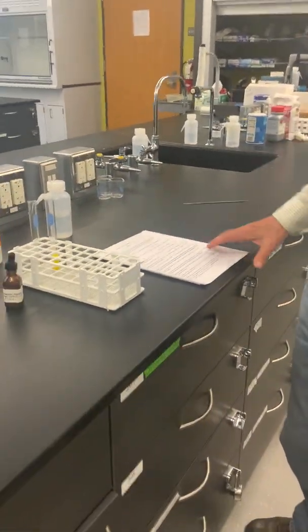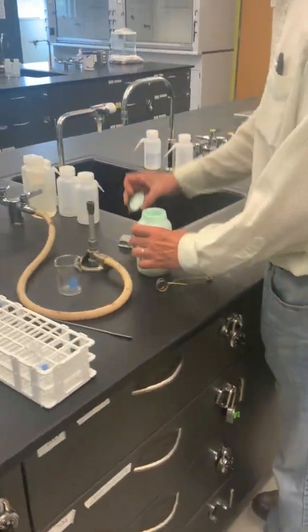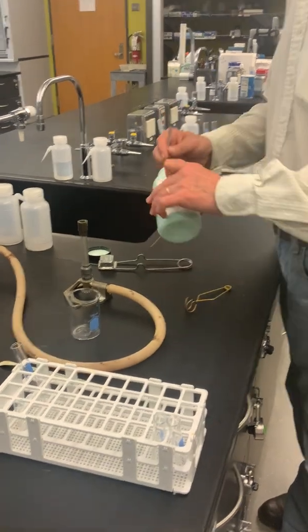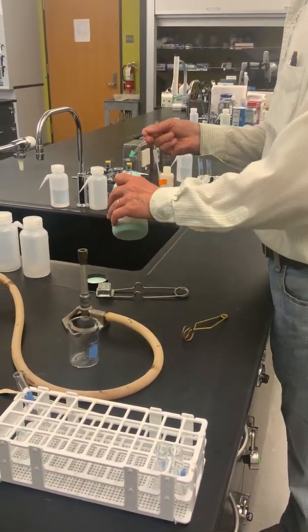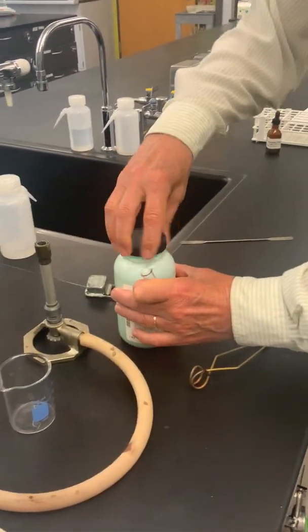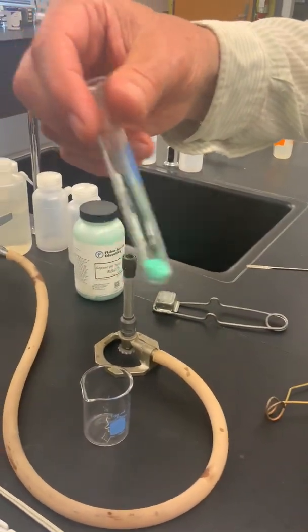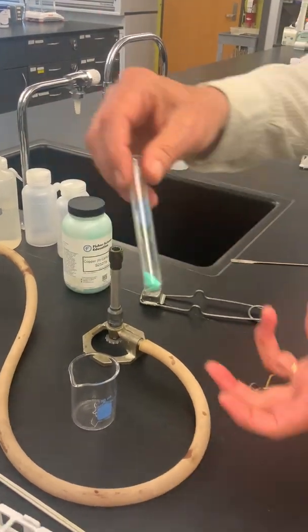Moving on here to our second reaction involving the decomposition of copper 2 carbonate. Scoop some out of here, and we'll have a look. It is, as you can see here from the video, a green powder, green solid.